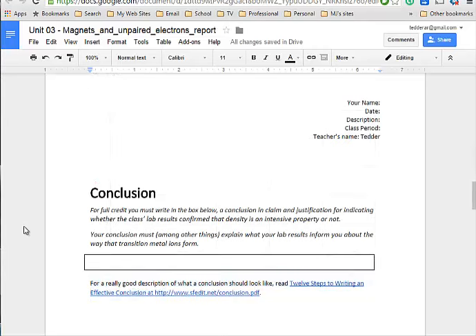When you have built your 2 different graphs, one graph will have an x-axis, a horizontal axis, an independent variable with one set of data for the number of unpaired electrons. Then you'll flip over the worksheet and build a second graph from the same mass measurements from which you got your force measurements, your force calculations. But you'll change the x-axis and you'll have different numbers for the number of unpaired electrons. And so you'll have a second graph, and you've got to compare those 2.